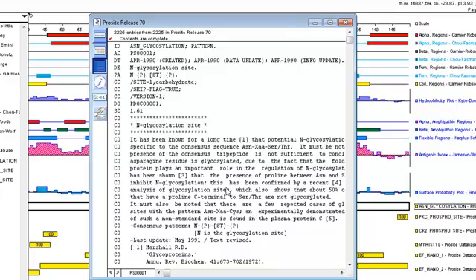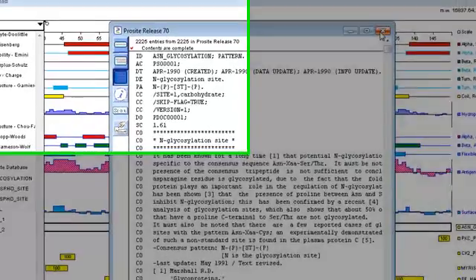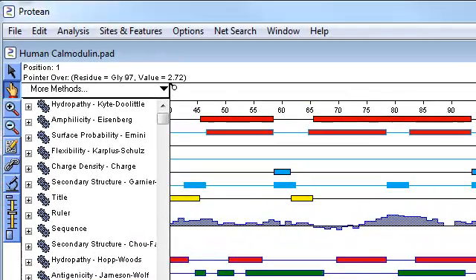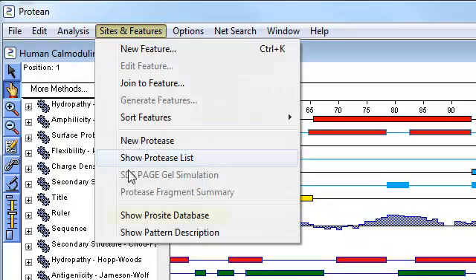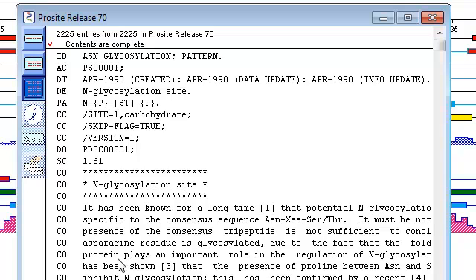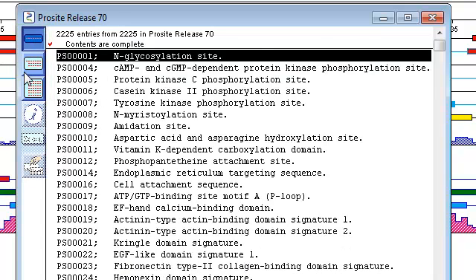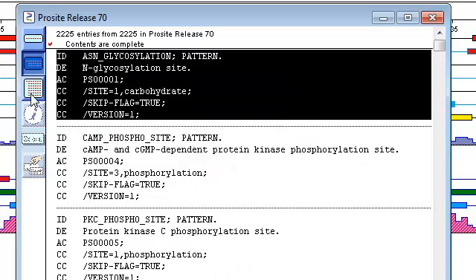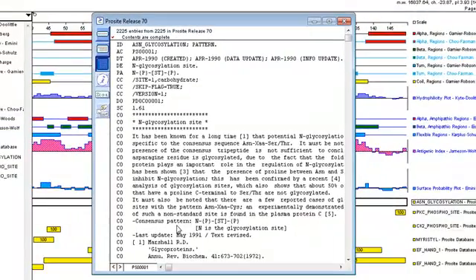At any time, you can also view and search the ProCyte database simply by selecting Sites and Features, Show ProCyte Database. Use the three icons at the top of the toolbar here to display either a one-line summary, a brief description, or a full report for each pattern.